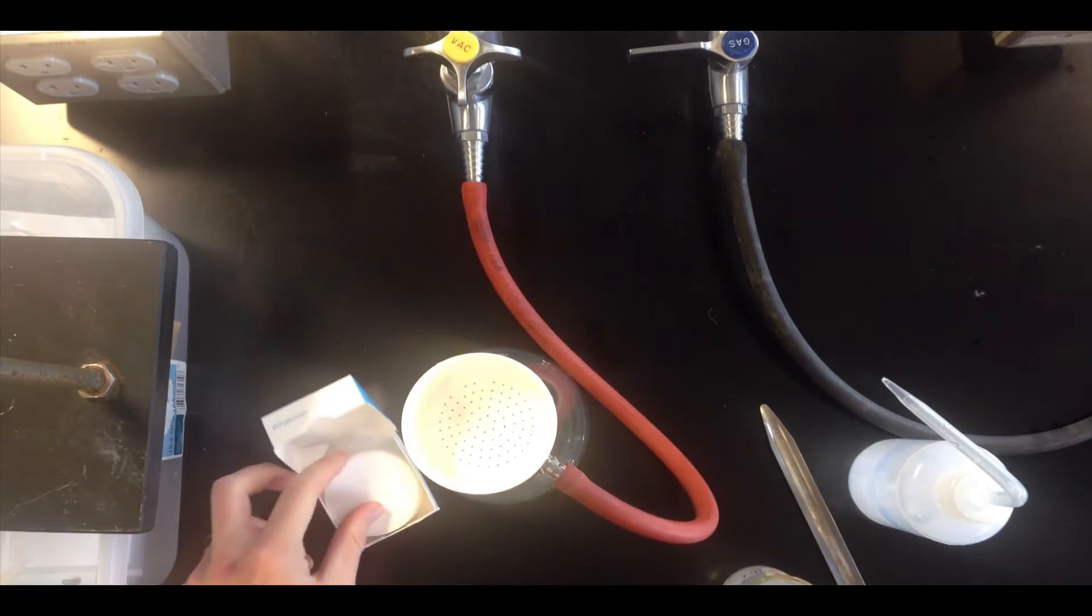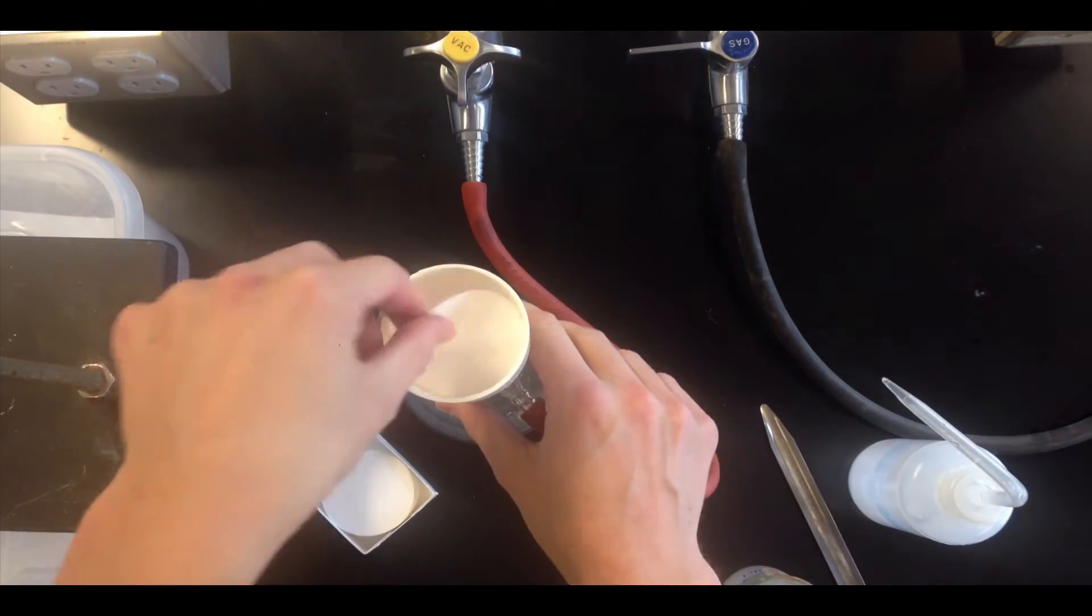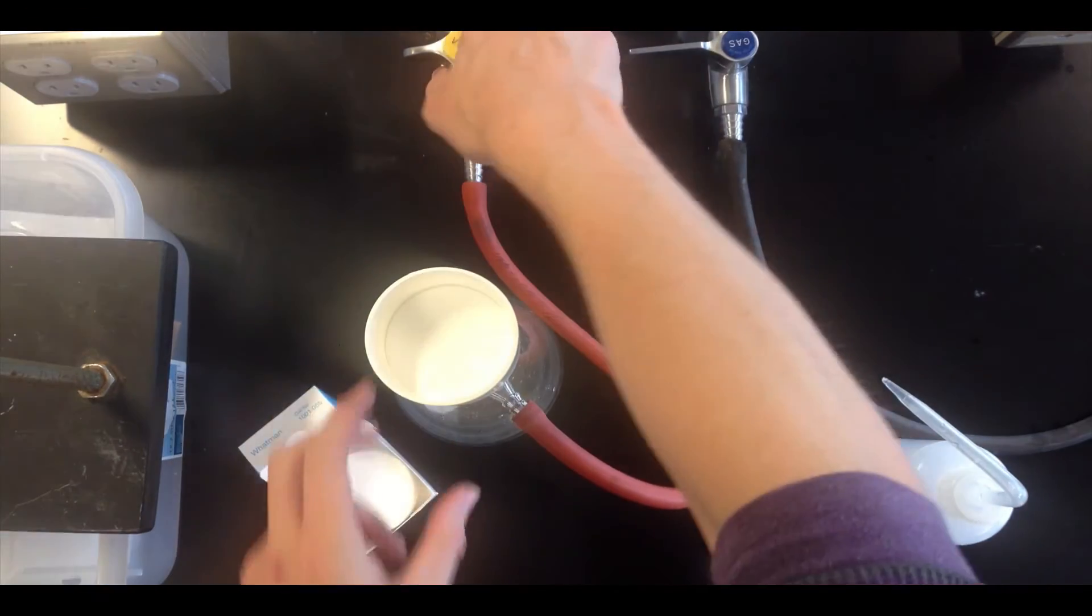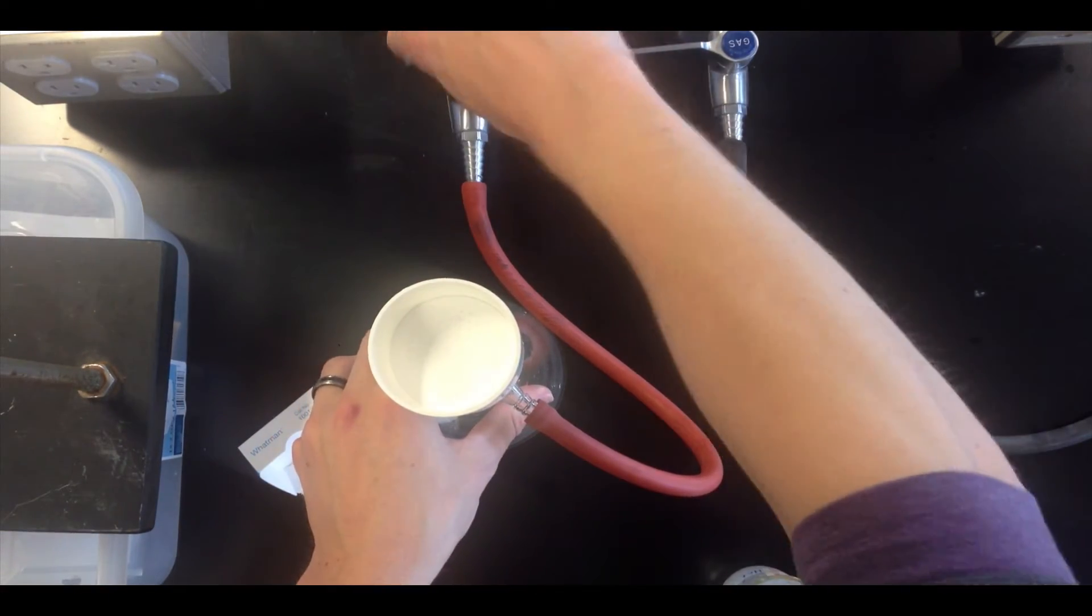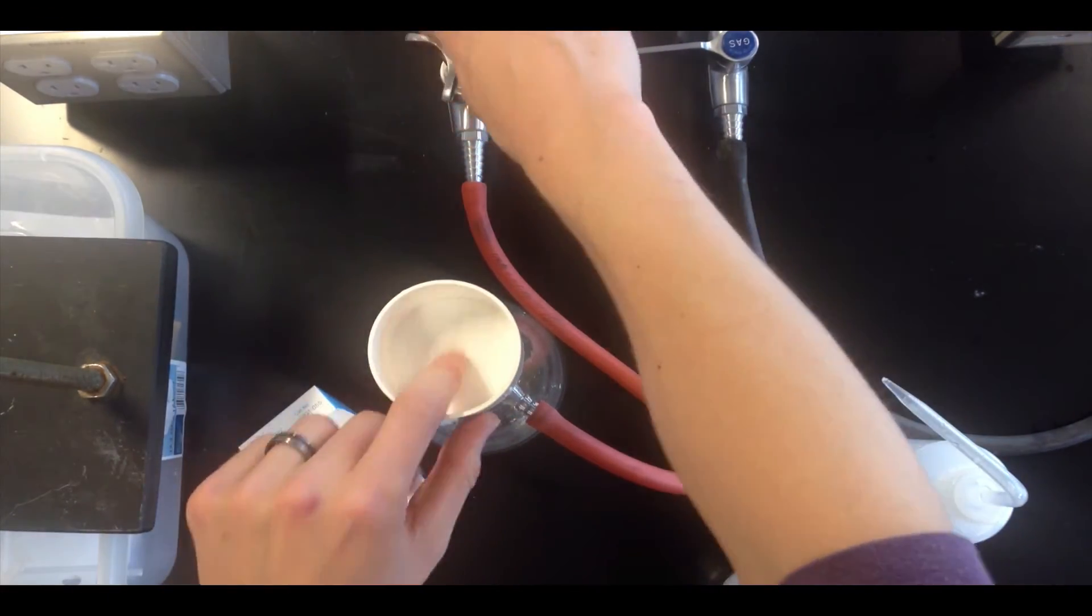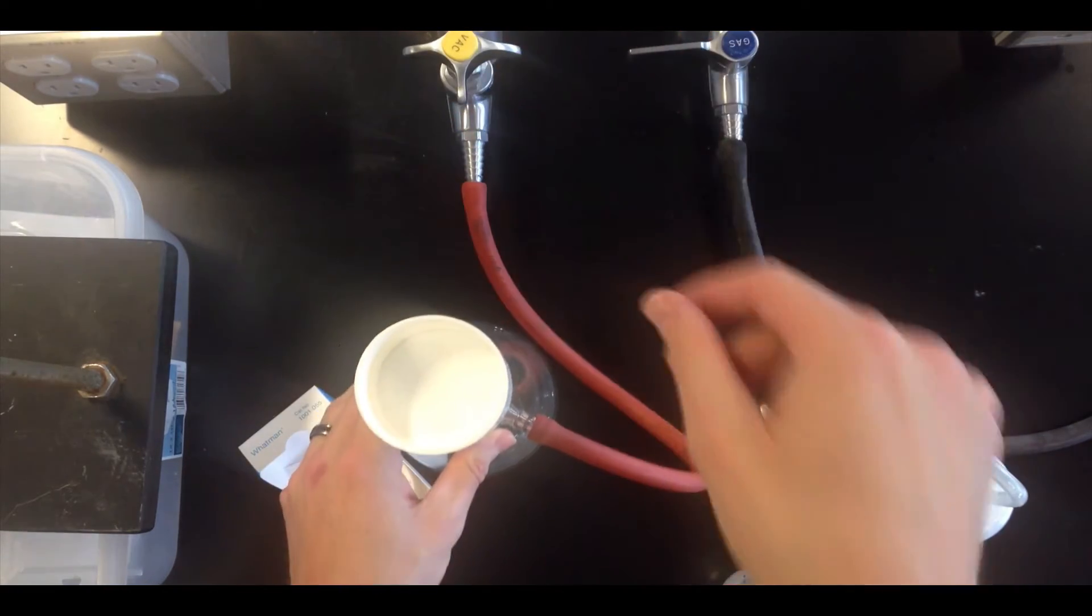That's pretty much all there is to setting up the apparatus. We'll throw in a piece of filter paper on the top as well, and now we can go ahead and turn the vacuum on, and this is going to pull that filter paper right down on top of the holes in the Buechner funnel.